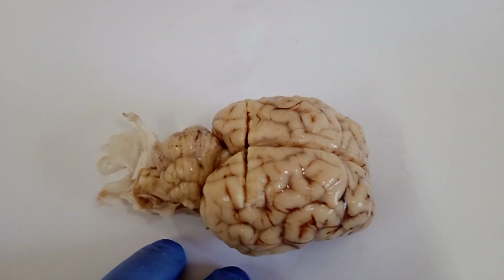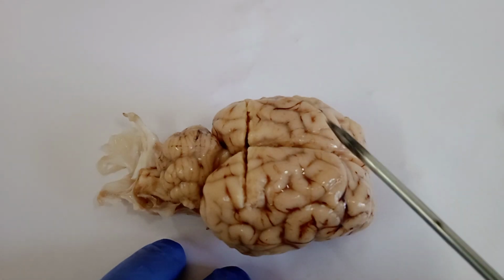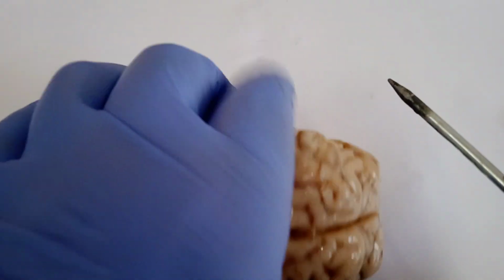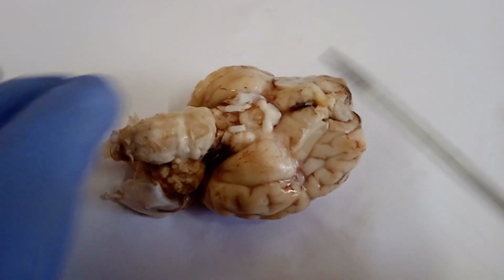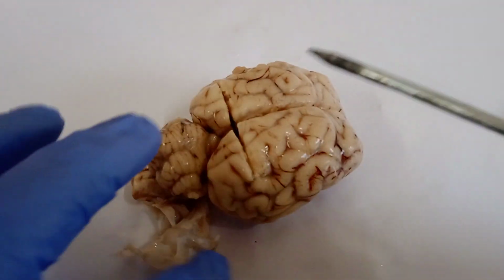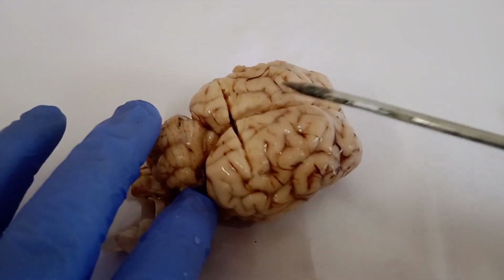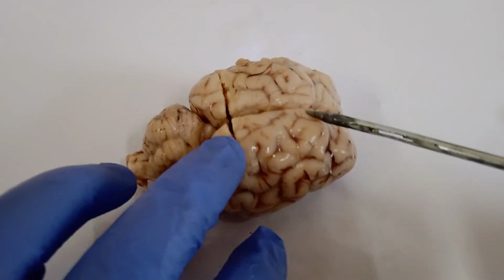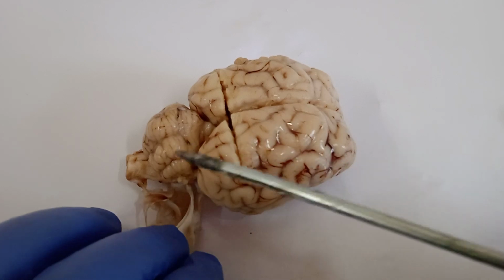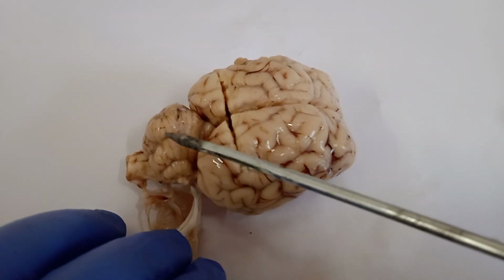Last time we discussed that this brain has two surfaces. One of the surfaces is this, the dorsal surface, and the other is the ventral surface. And today we are going to dissect it and see what are the things in the medial aspect of this brain. As you know, this brain has one bigger part, which is the cerebrum, and the smaller part here is the cerebellum.